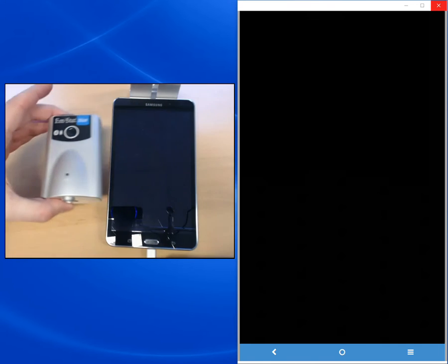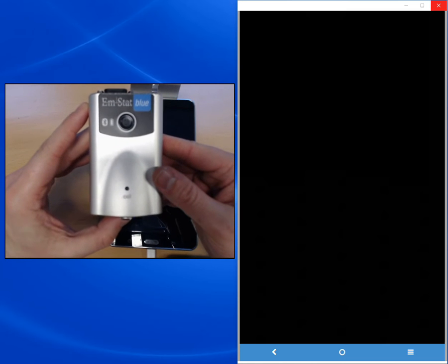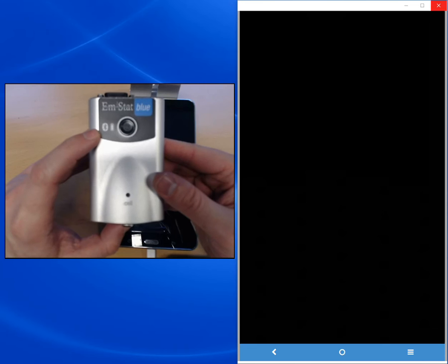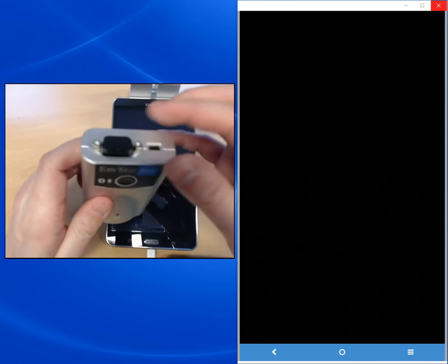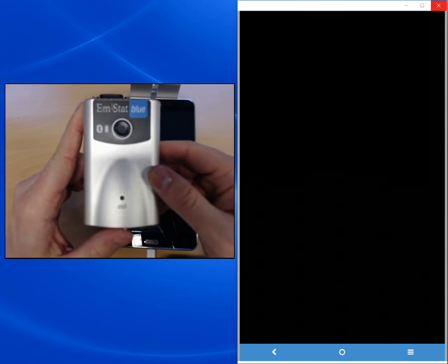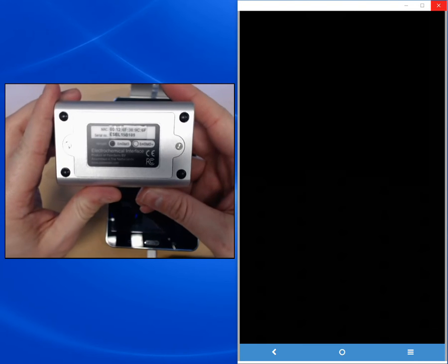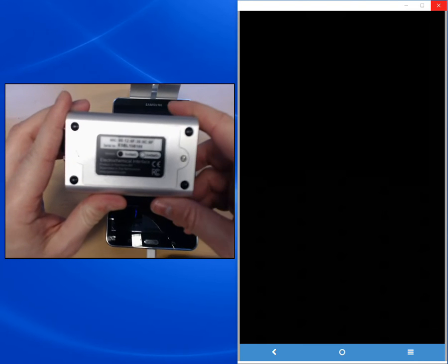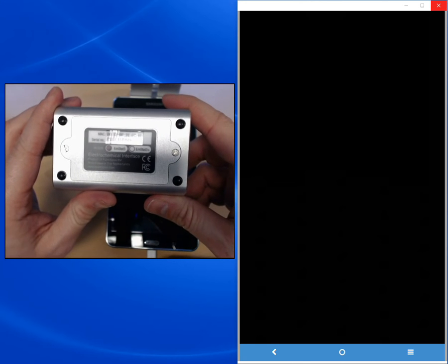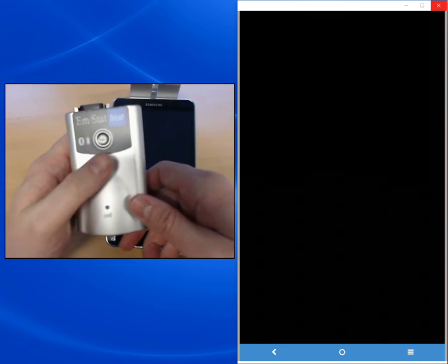During this demonstration I will use an EmStat Blue. The EmStat Blue is the bigger brother of the EmStat. It is equipped with an internal battery, it has internal Bluetooth, and it also has an auxiliary port. On the back of each EmStat Blue you can find the MAC number. The MAC number is used to identify a device when you connect to it via Bluetooth, and it will also make it easier to find a device after you've paired with it.